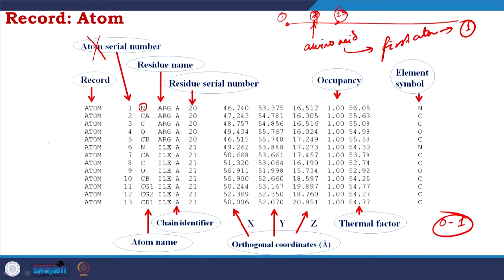Okay. Why is it very interesting, as I told? If your protein's amino acid has an altered conformation, suppose you have a serine, so CH2OH, if that serine has 2 conformations equally populated, the occupancy would be 0.5, 0.5.